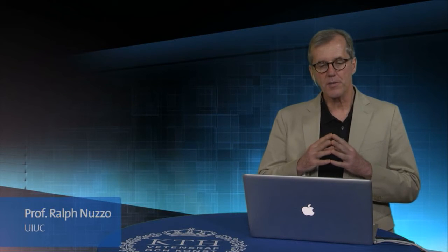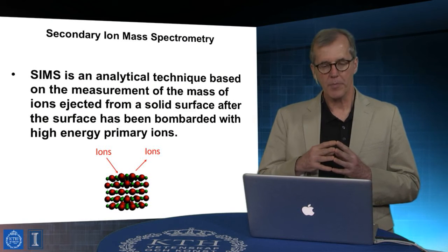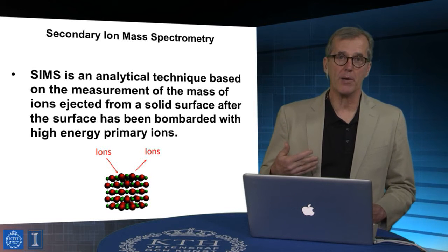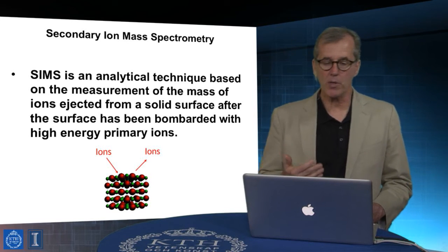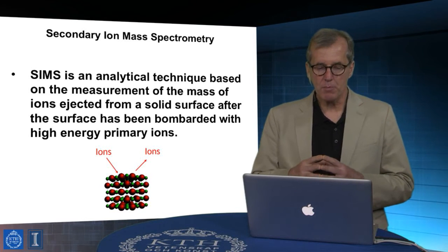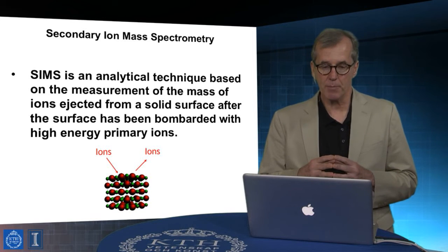In this lecture, I'd like to speak to you about another approach to looking at the chemistry and structure and composition of material surfaces, but actually a set of measurements that can in fact be used, in an interesting way, to also look at properties of matter approaching more bulk-like extents. And that is measurements based on the measurement of ion fluxes coming from a sample.